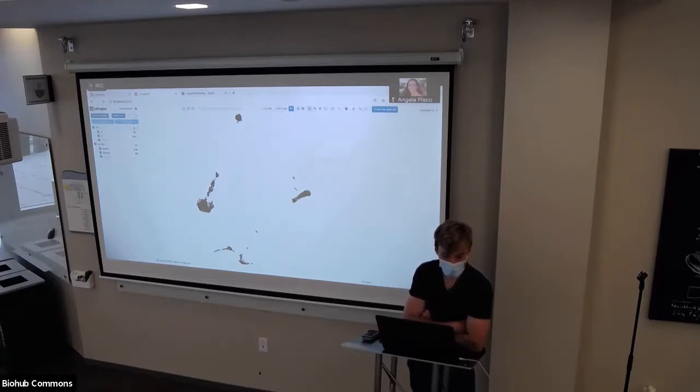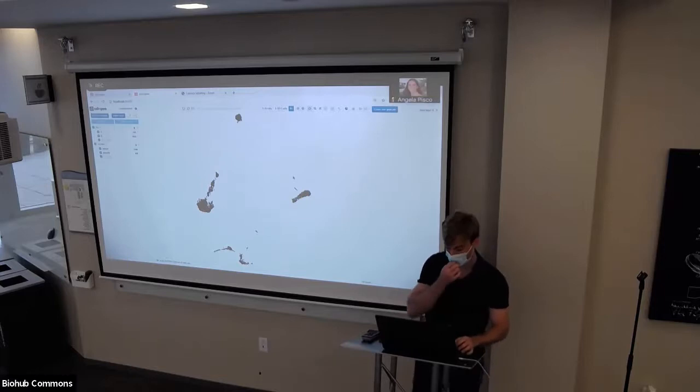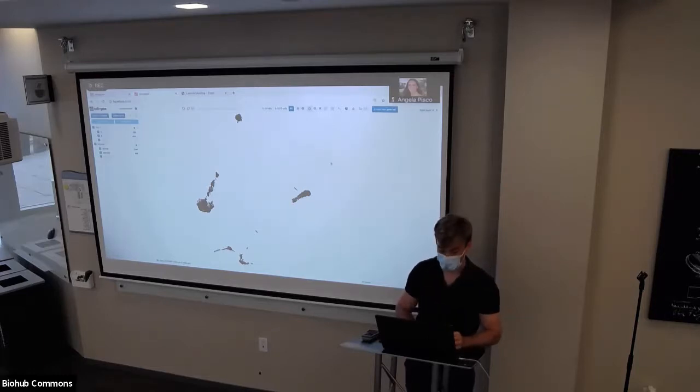Probably beneath the level of this tutorial, but could you just walk through a very simple example case for me where you want to look for the top 3 cell types that have the highest expression of, let's say, ACE2, the gene? How would you go about that? Because that's something I might conceivably want to do with this software. Yeah, so let's try that.